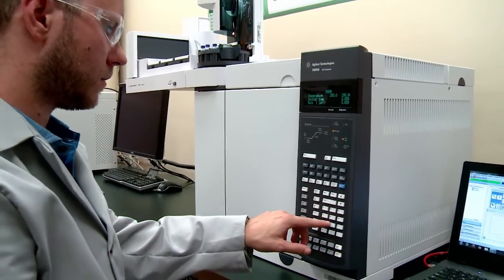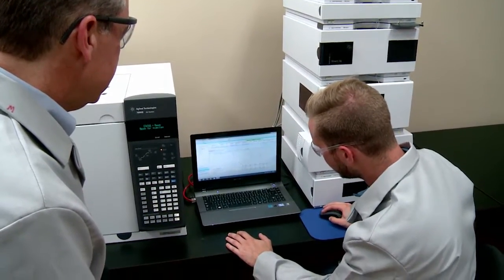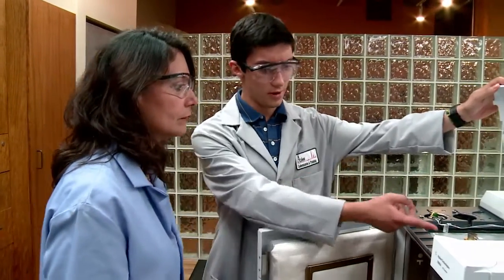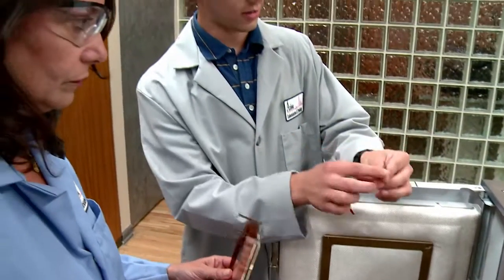The reality is there's a lot of parameters that you have to set properly in order to get a valid GC result. Think about this, you have to set the correct column length, diameter, film thickness, stationary phase, mobile phase, flow rate, injection port temperature, column temperature. All of these things have to be set properly. So I see the trends going on in the GC world as fast GC. Everyone wants results faster. They also want their instrument to be more reliable and easier to set up, easier to transfer methods. So to do that, you have to simplify the instrument. You have to get people to understand how it works and make it easier to use so it's easier to troubleshoot, easier to fix, and easier to transfer methods.